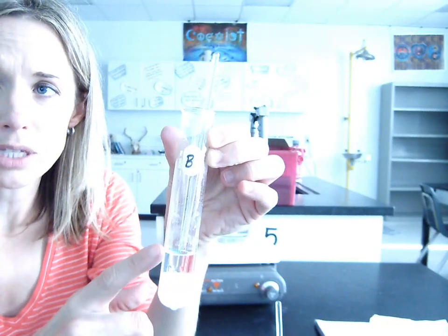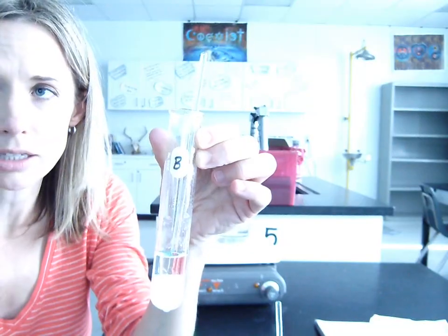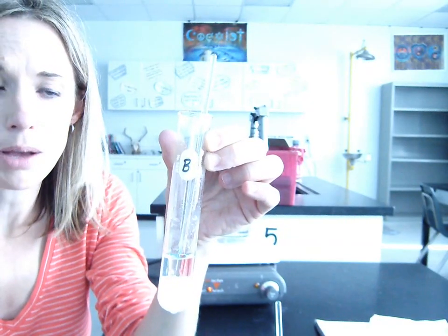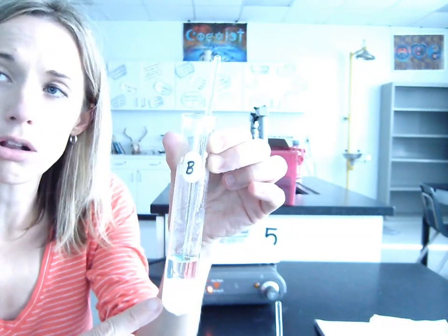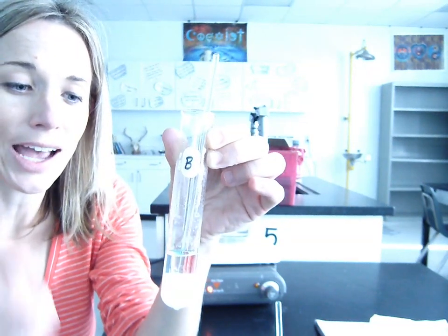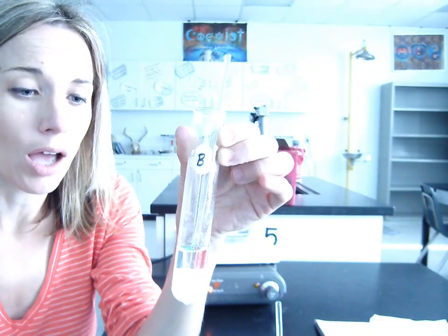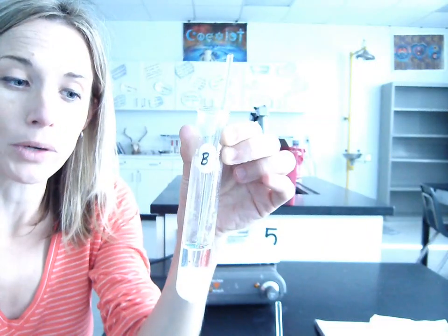We heat this one up, substance B, and it totally dissolves. The whole thing becomes crystal clear, like it looks like it's just water at a very high temperature, close to 100 degrees Celsius. As soon as we bring that temperature back down again, all of that stuff comes right back out of the solution. And it's really neat because you can actually see it seemingly appear out of nowhere. It looks like it's just sort of coming from nowhere. It's actually kind of neat.